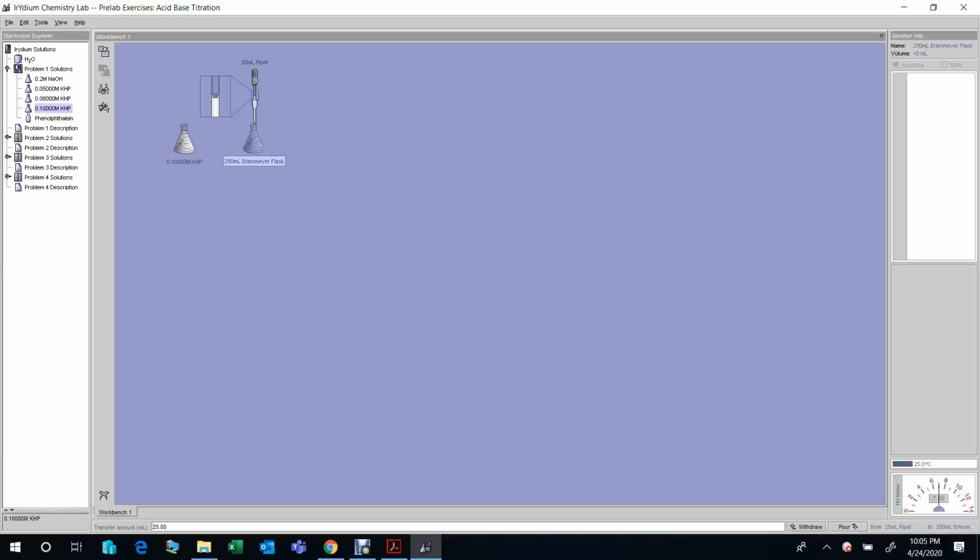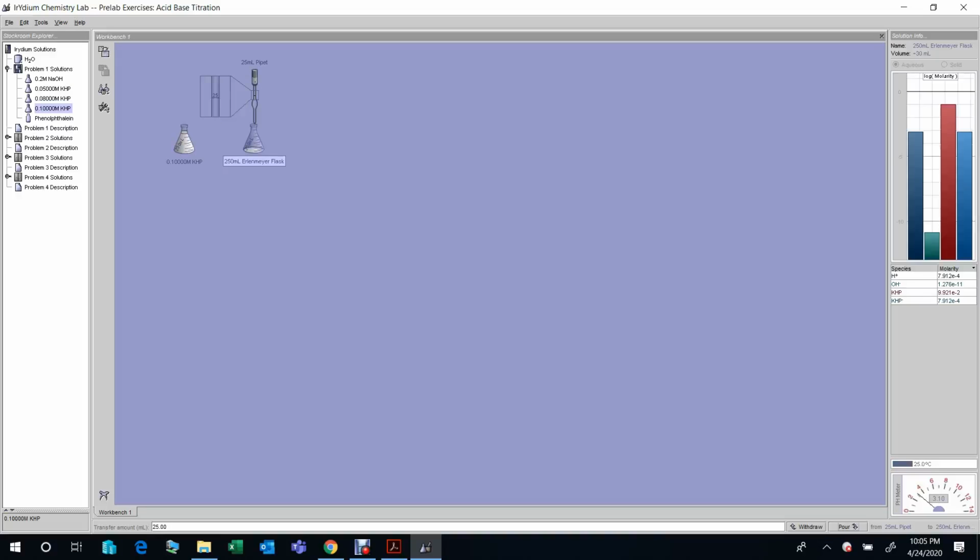Okay, this is very accurate. This volume is very accurate. We get 25 milliliter solution.